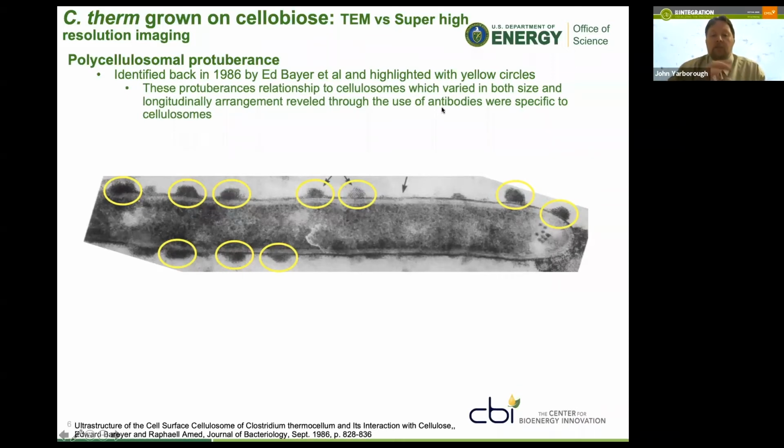And as he presented this work, one of the questions came: are those real? Is that an artifact due to the staining procedure? It was still questioned what those were. People were somewhat skeptical if they were polycellulosome protuberances.